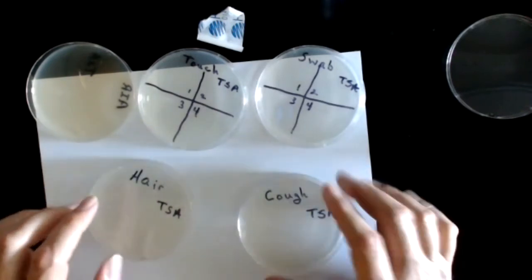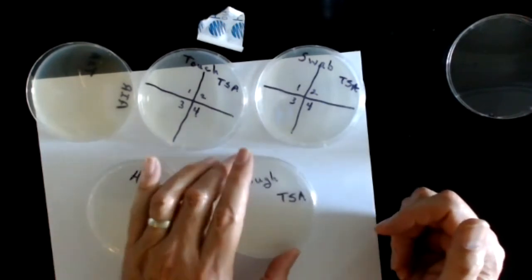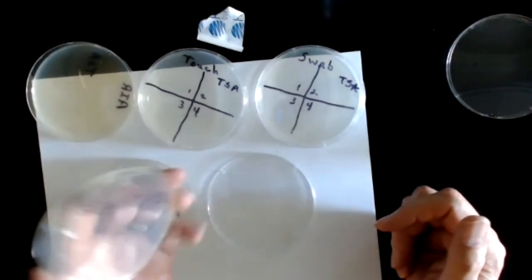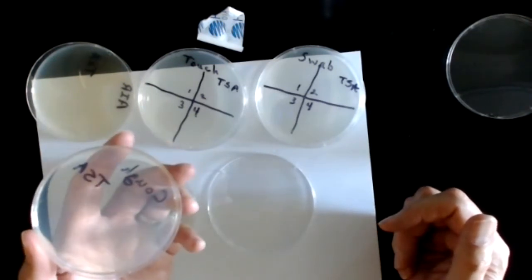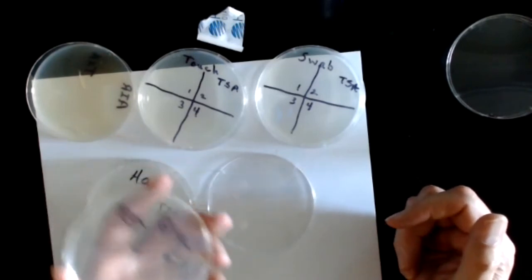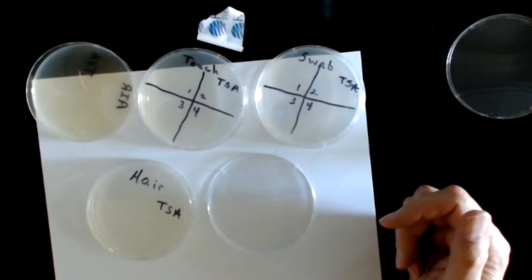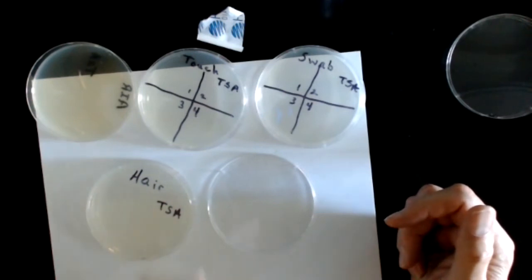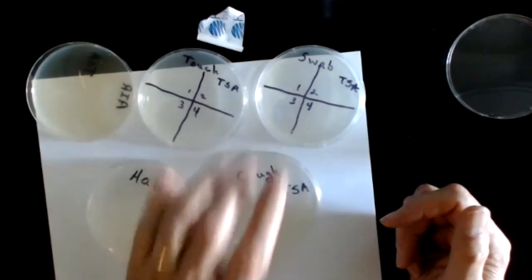plate. The 5th plate is the cough plate. Any one of the students in the group can take this plate, lift the bottom up, and turn it over so the agar surface is right side up and exposed. Then I'm going to do this off camera, but you'll be able to hear me. What they would do is take the plate, hold it about 5 or 6 inches away from their mouth, and cough a couple of times onto the surface of the plate. Once you have done 2 or 3 coughs, you then turn the plate upside down and replace the bottom to the top.